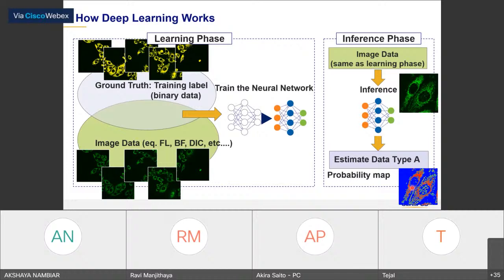This one is the probability map. Red means a high probability, and of course blue is the low one. So after the inference, it is almost a similar way to the intensity thresholding which we usually do, so we need to have some kind of threshold to segment the object by using the probability map.